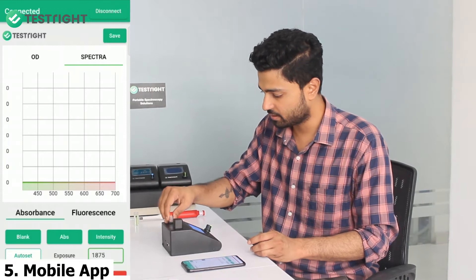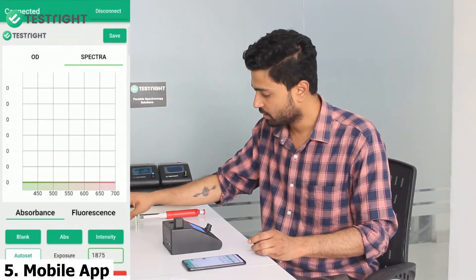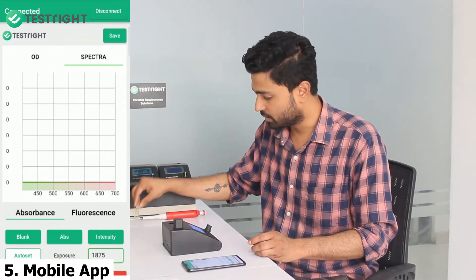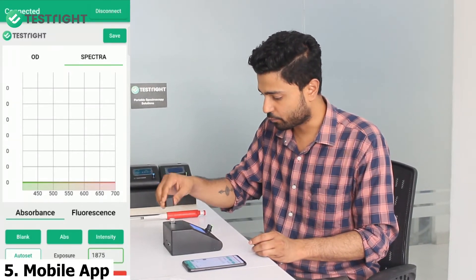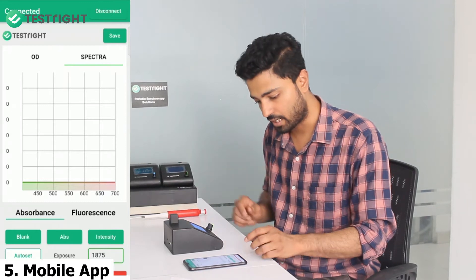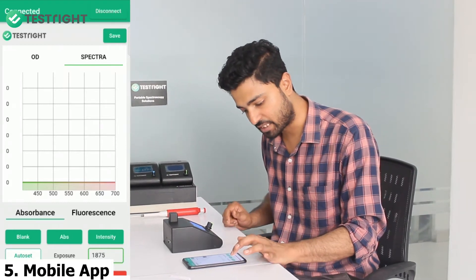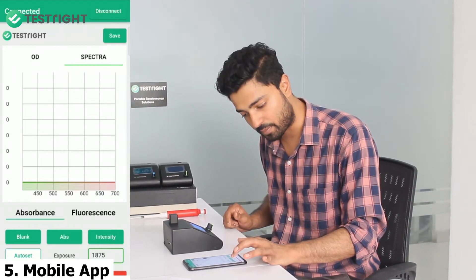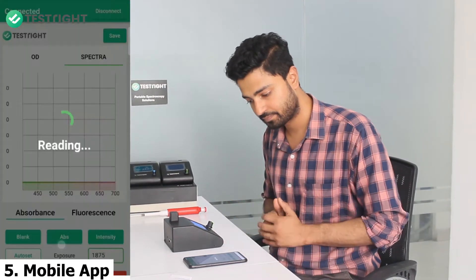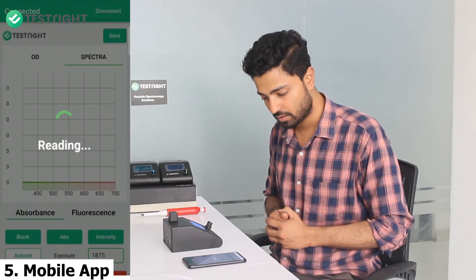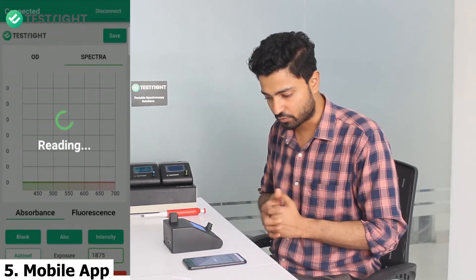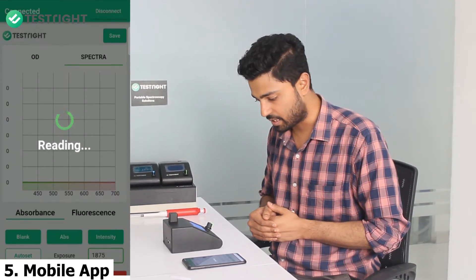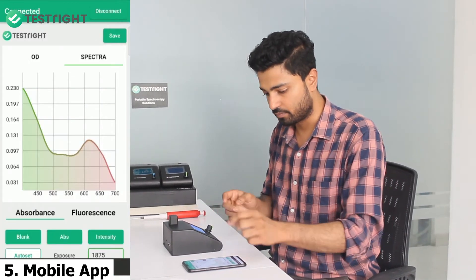Now we take the sample in the cuvette, put it in, and click on the ABS button to take the absorbance. We wait for two seconds and there you are.